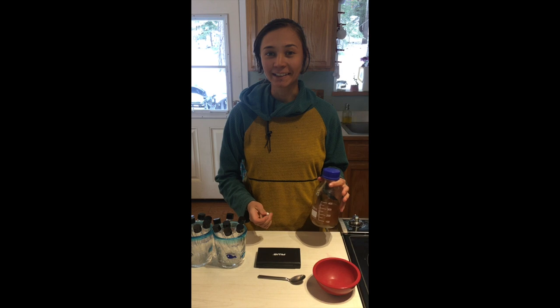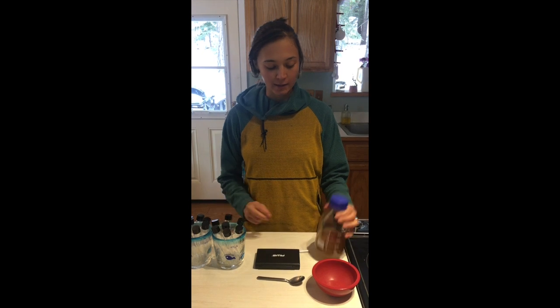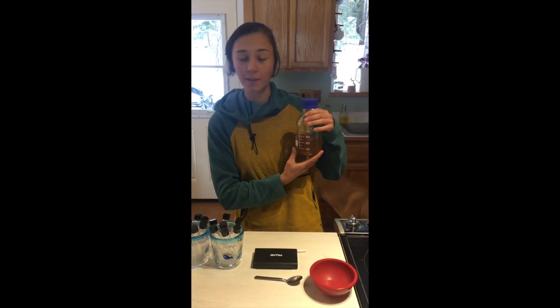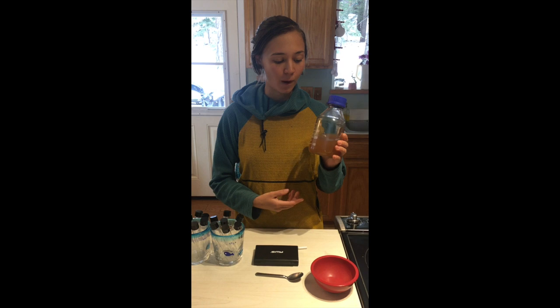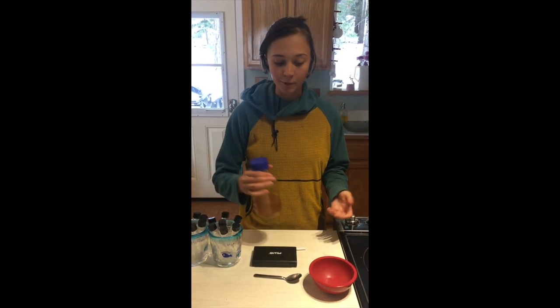Hey guys, gohyphy here. Today we're gonna be making agar slants. I've got my test tubes, and in this media bottle I have 250 milliliters of grain soaked water. I cooked grains yesterday, so I thought I would save the water and use it for the agar — that should be nutritious enough for the mycelium to grow on.